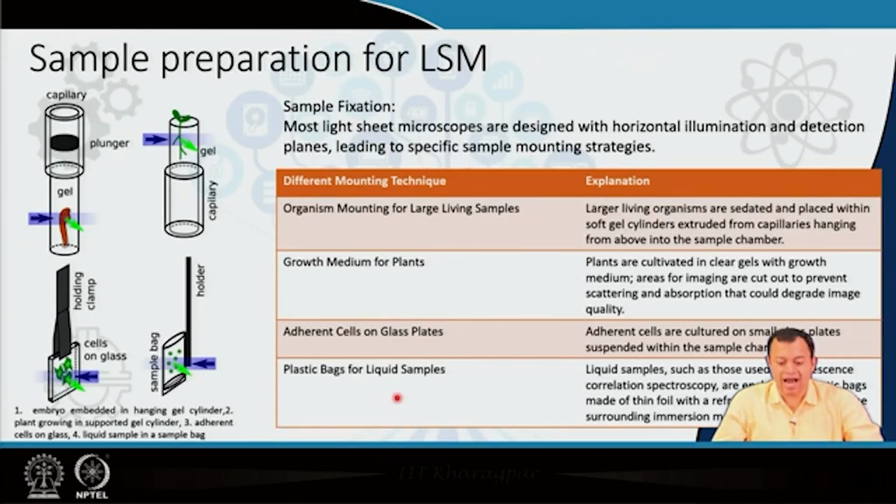How do you handle the samples? There are holding clamps on which cells are put on a glass, and then you are illuminating it like that, extracting samples, detecting it from like this.